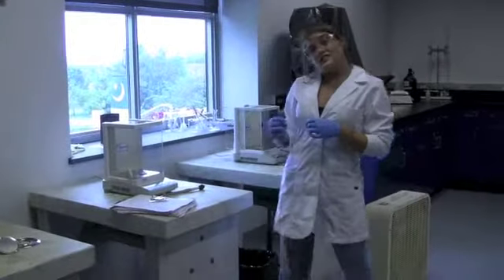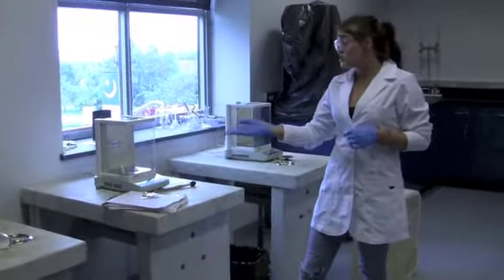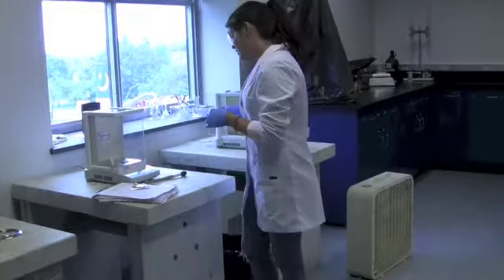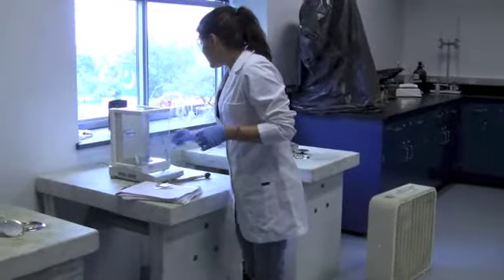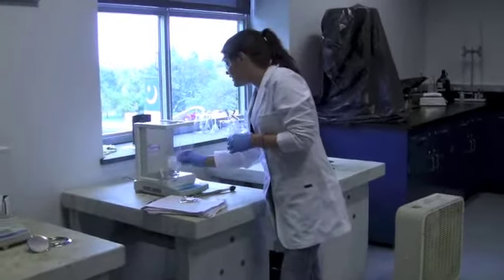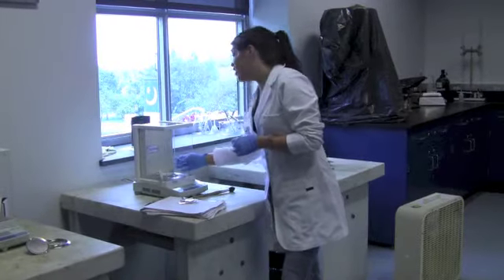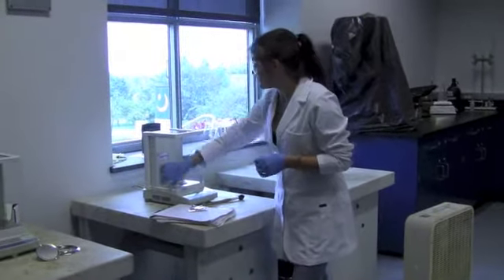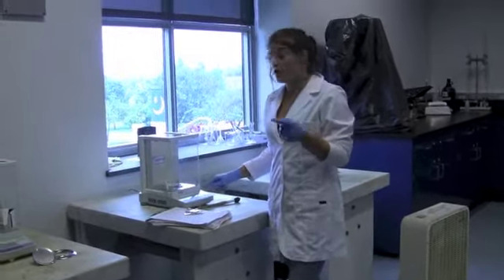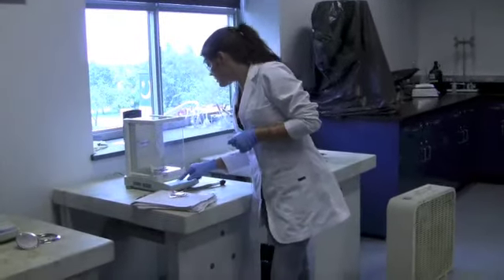The first thing you need to do in this experiment is to measure your aluminum foil to about 0.5 grams. When you're using a scale, you always need to remember to use a weighing paper so as not to contaminate anything, and to close all doors to make sure that air doesn't disrupt your reading. Also make sure to zero out your scale before you go to measure anything.